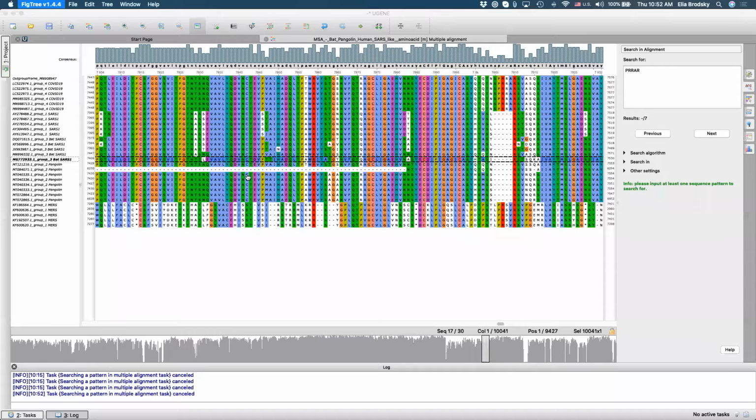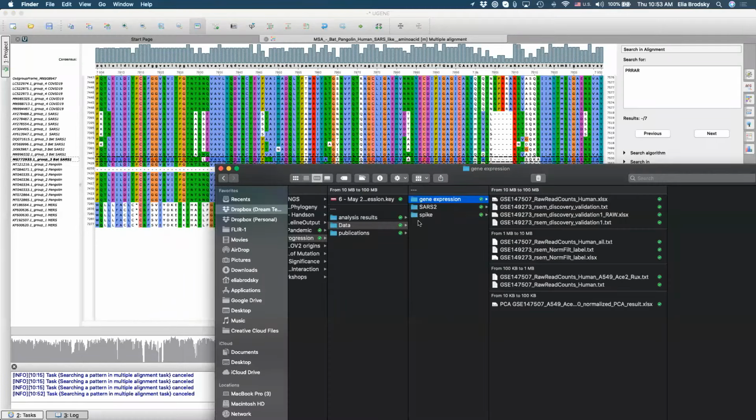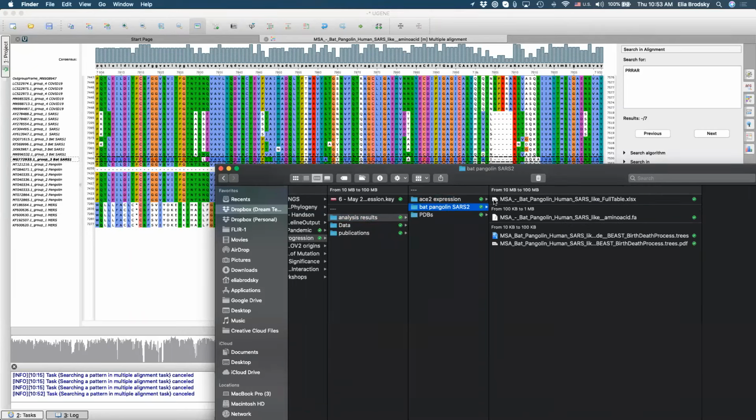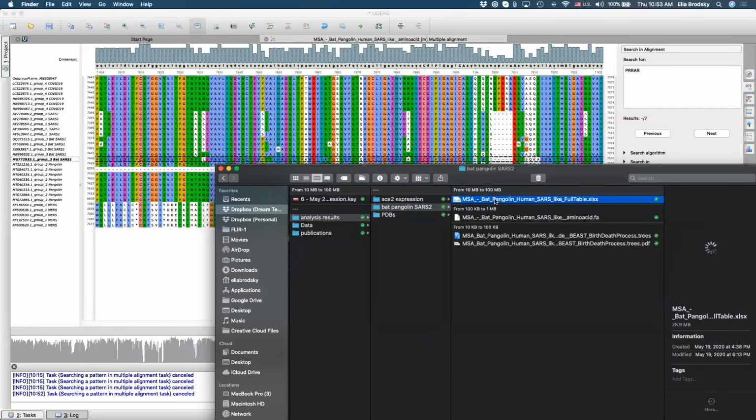Okay, the other file that we said was an output from last time was actually the TSV that has all of the sequences together, right? And so it looked like this. It was in TSV format, but essentially this is something that we can open in Excel. So let me show you what we can understand from that Excel file or from that table in terms of sequence similarity, and kind of link it to what we reviewed last time in some of the papers that we had.